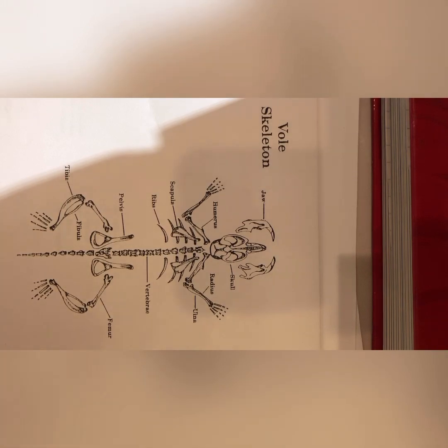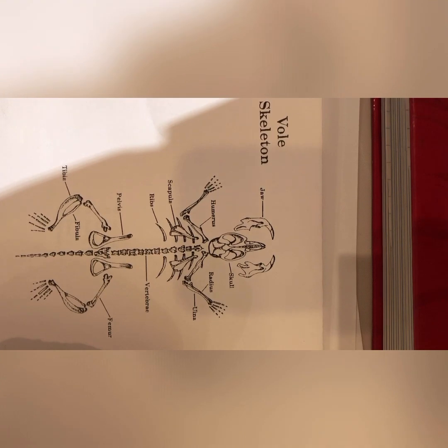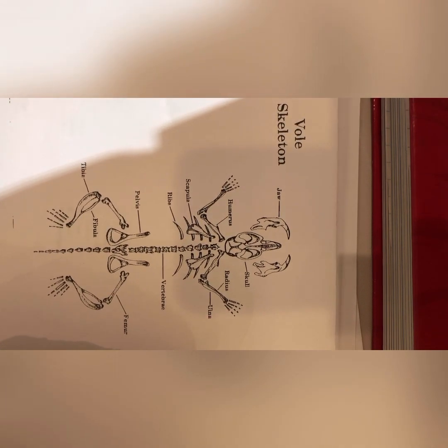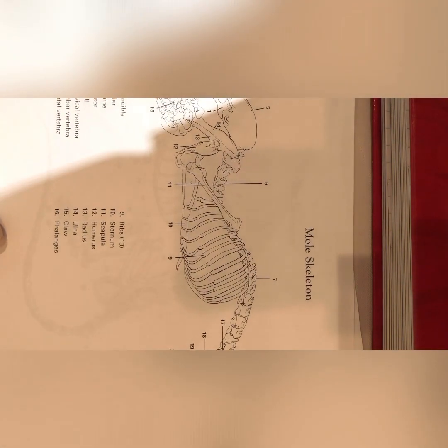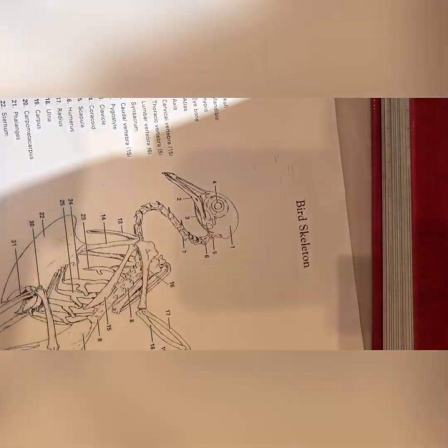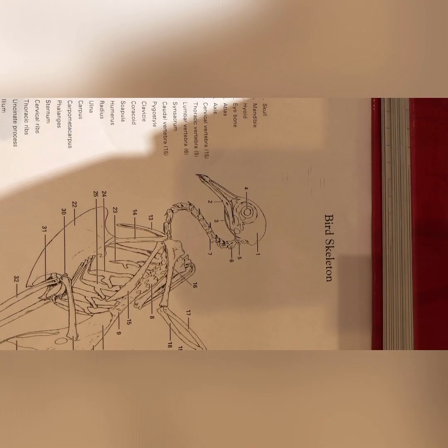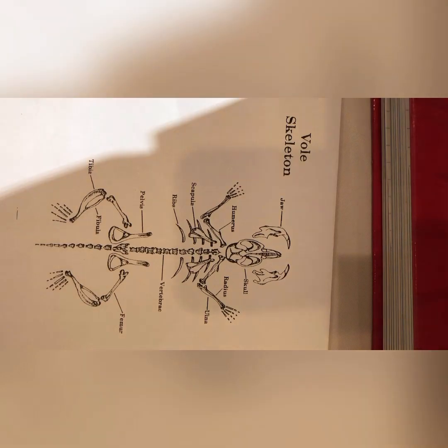So what I have here are a couple of the diagrams of what the reconstructed animals would look like. And so what I have here are the voles. The next one is a mole skeleton, followed by a rat skeleton, and finally the bird skeleton. Now, looking at all of the bones that I collected, it's most likely that I have a vole.